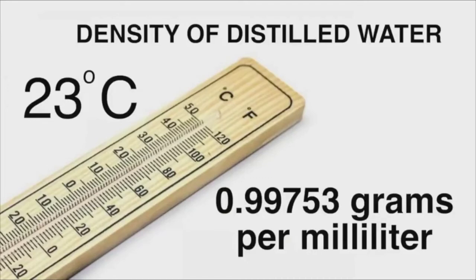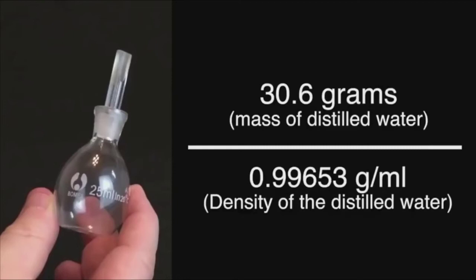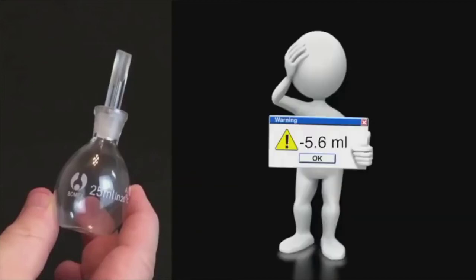Capillary pipes on the plug of this pycnometer bottle have the function. Number one, can make more careful measurements. Slight changes in the content of the pycnometer because of the change in temperature will give a large change in the surface height of the capillary pipe.